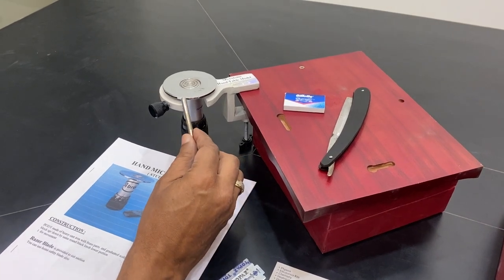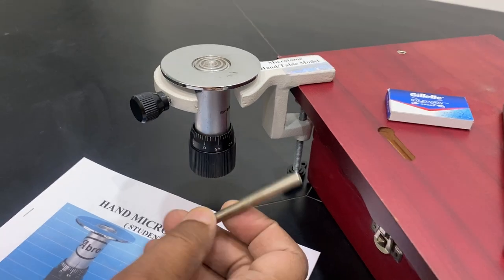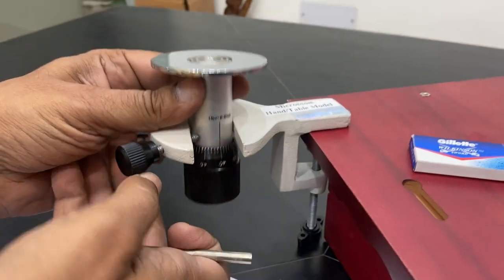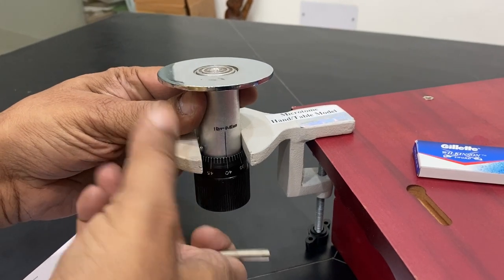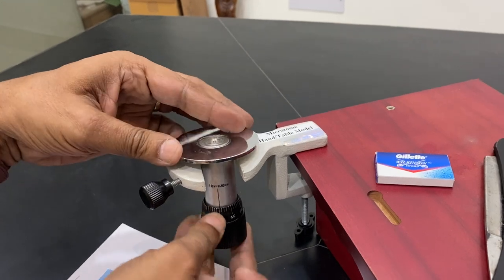This is a hand microtome or a table microtome. It's a manual one, very easy to use. You can remove the microtome from the center by opening this part and then put it back.